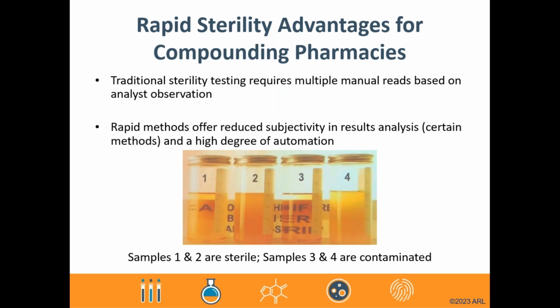The benefits of rapid microbial detection extend beyond just faster time to result. While the faster result is obviously a major positive impact of rapid detection, users of many systems also gain the ability to address and better meet data integrity expectations and requirements from their governing agencies. With some of the technologies discussed in this presentation, the implementation of a rapid sterility method replaces the subjectivity of traditional visual confirmation with an automated assay controlled by an instrument. Results are controlled and reported through the software, thus avoiding transcription and interpretation errors potentially caused by an analyst recording or reporting handwritten results. Instrument use logs can also be generated, which can help meet certain audit trail requirements.